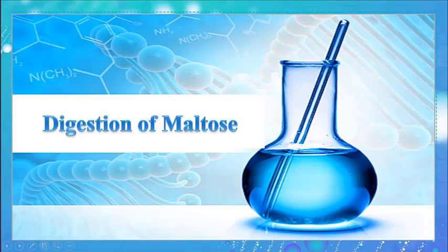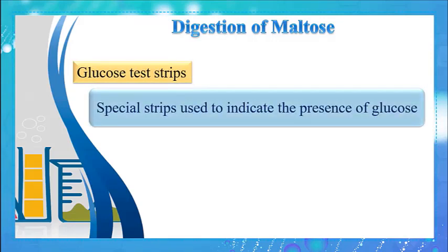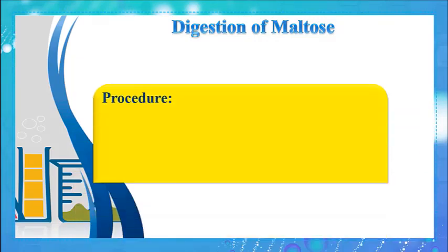Let's now study the digestion of maltose. What are the glucose test strips? As their name indicates, these are special strips used to indicate the presence of glucose. How do we use these strips?